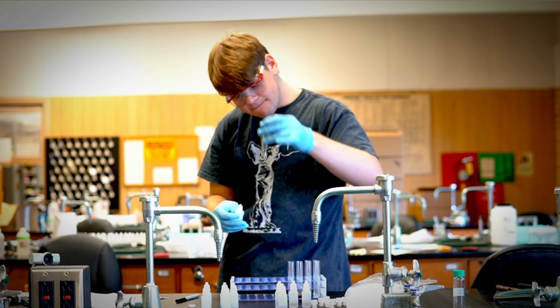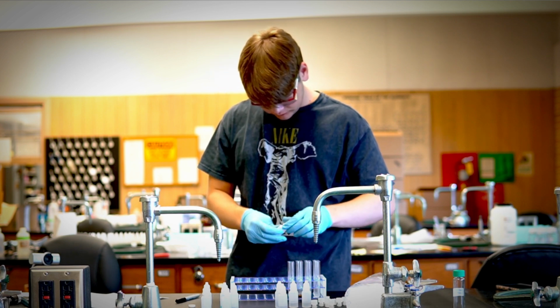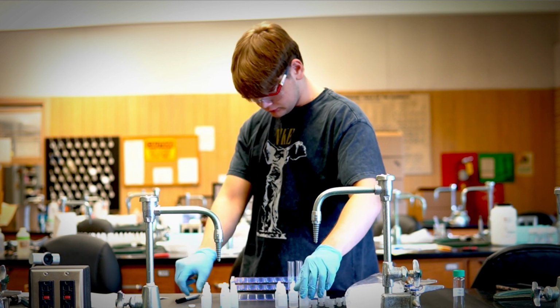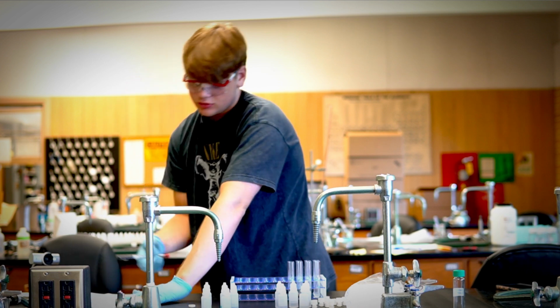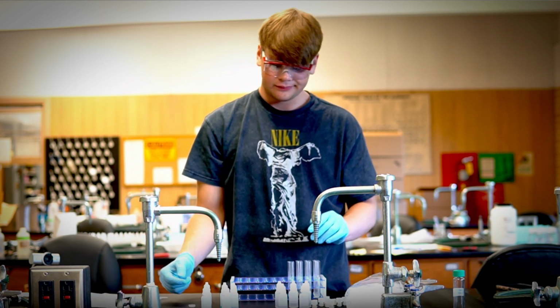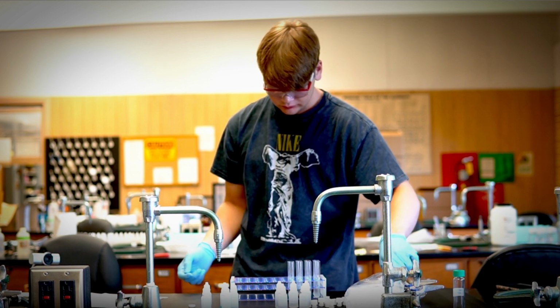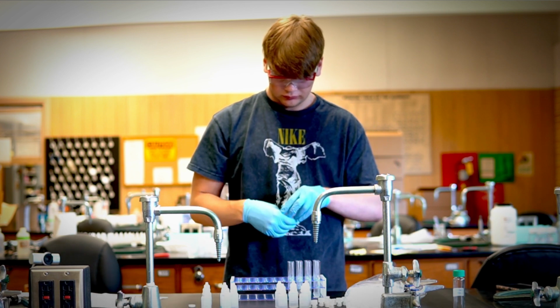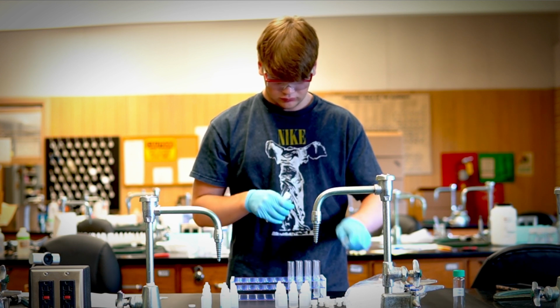During the anions, make sure that you look closely at the observations, because not only are we going to get a change of color or a precipitate, but in some of the tests we should all see some bubbles or formation of gas. And for each one of the tests, make sure that you use the unknown as well.